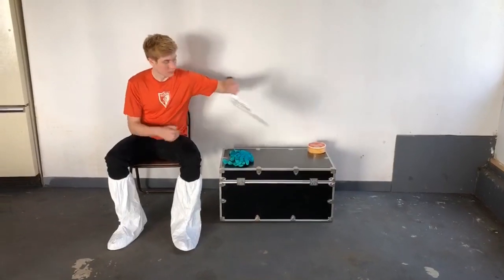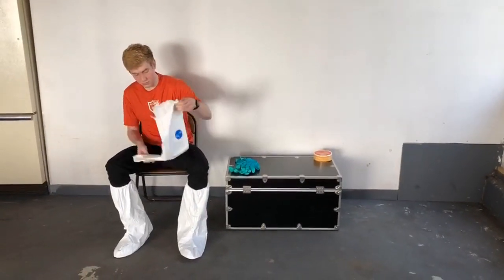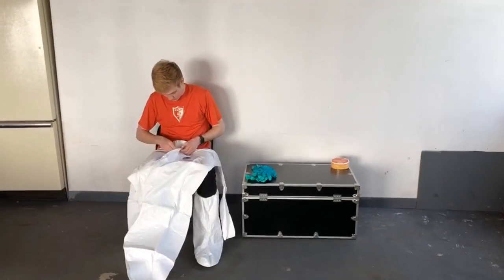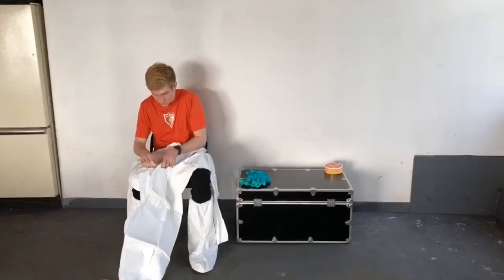He's going to take the Tyvek coverall that came out of the package and unfold it. You'll need to unzip it, and it's certainly easiest to put this on while still sitting down, at least up around your waist.